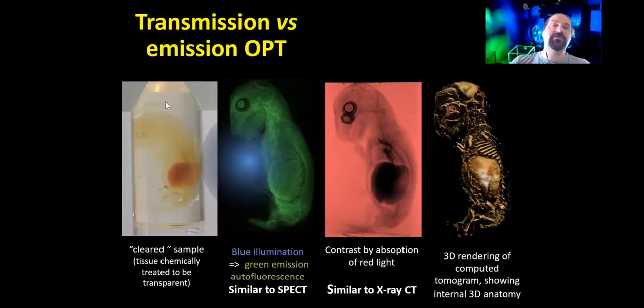And here, this rabbit embryo is shown inside an agarose block after it was rendered transparent by a tissue clearing technique. Typically, we use a combination of benzyl alcohol and benzyl benzoate, which we call BABB, for clearing these samples and imaging them in optical tomography, but there are many other techniques for clearing tissues these days, which are being explored and which might have applications in optical tomography as well. After you've obtained the series of optical sections by computation, as I said, you can then reconstruct three-dimensionally and do these 3D renderings of your Z stack.